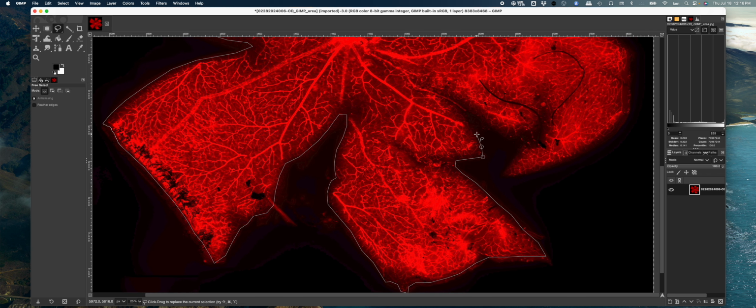But of course, that's what I've been using for 20 years with laptops, so it's very comfortable for me. When I need to bend around, this is actually ripped tissue in here. But the clicking point outlining does save a lot of time this way.